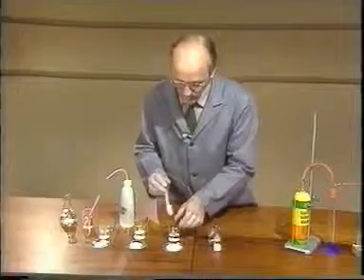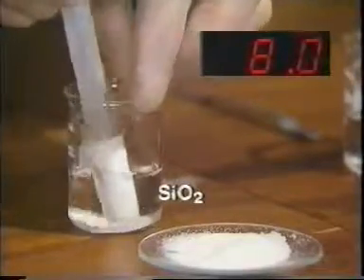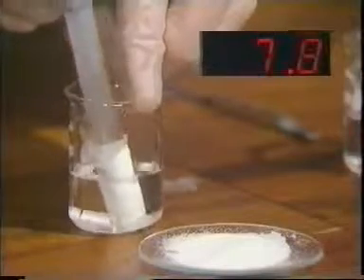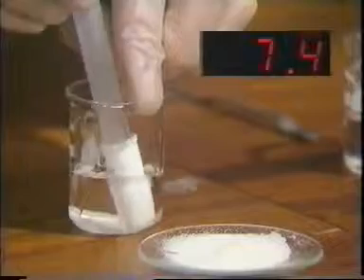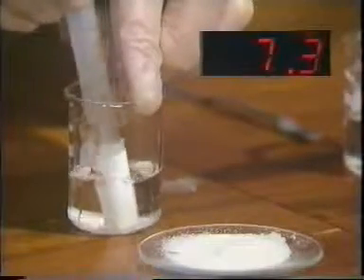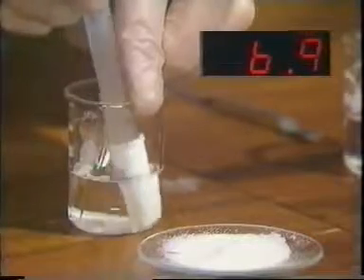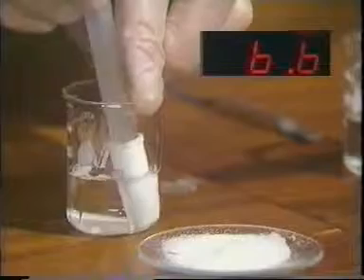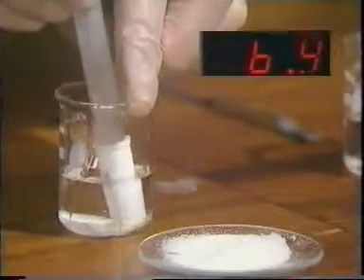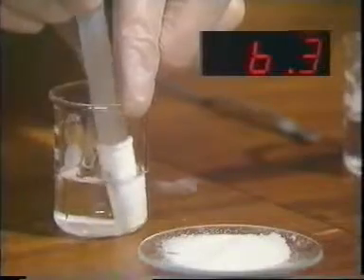Now I move on to the silicon dioxide. And here we have a pH of 6.8, down to 6.6, and that is much the same, still going down a little bit, much the same as the water that we're using.